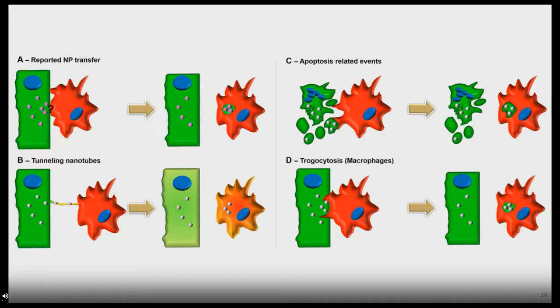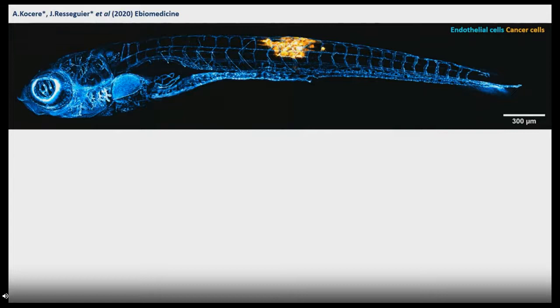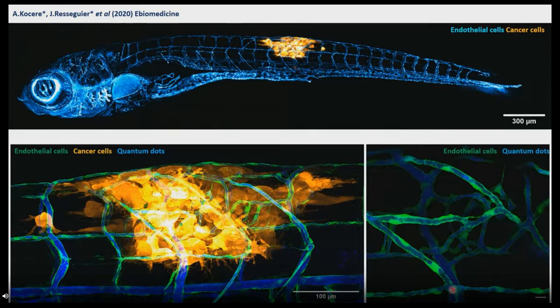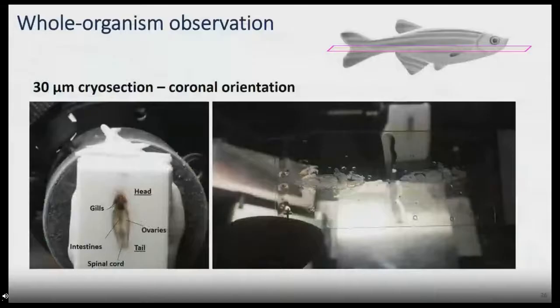We also explored other pathways and models. On cancer, in a publication we published last year, we can infect zebrafish larvae with melanoma cells (shown in orange) and observe glorious angiogenesis. Quantum dots in blue show that all these tumor-associated vessels are functional. We also look into the tuberculosis granuloma model, but unfortunately there is not time to present all of this. That concludes the live imaging part — now let's go into whole-organism observations.